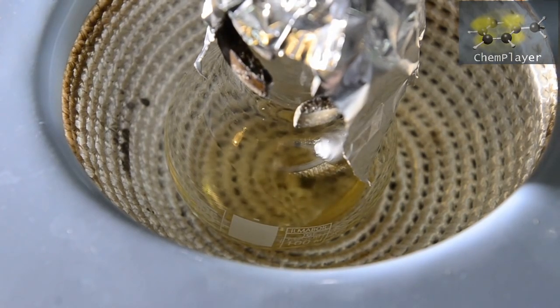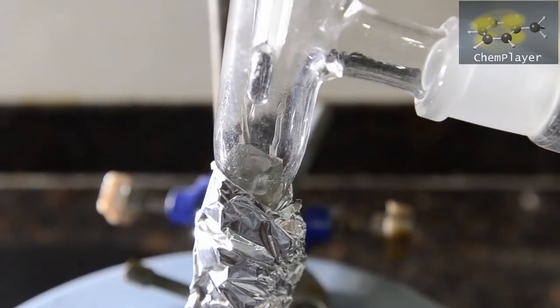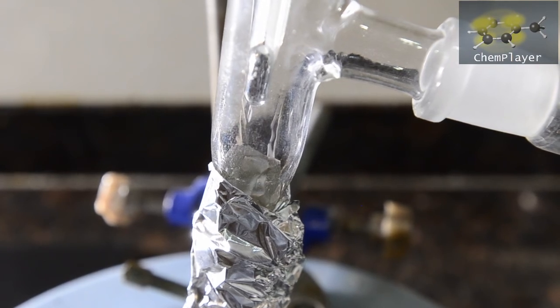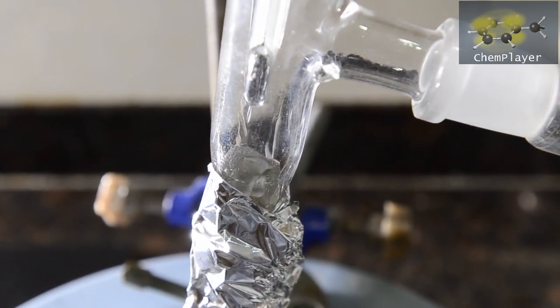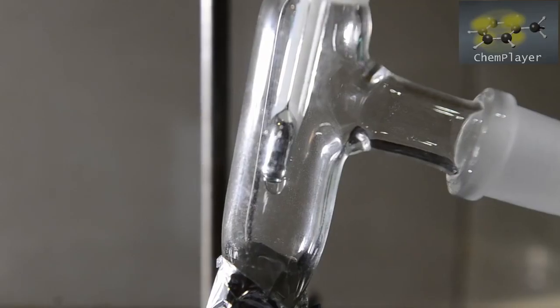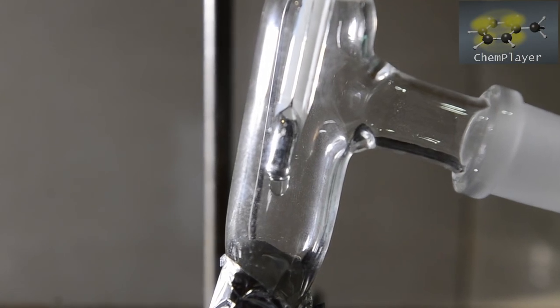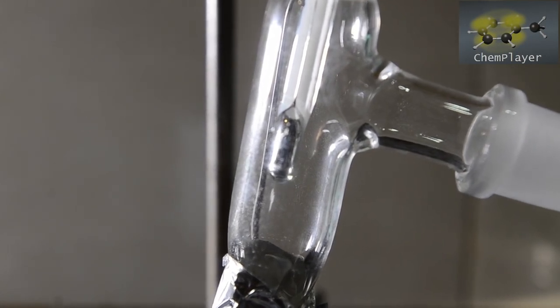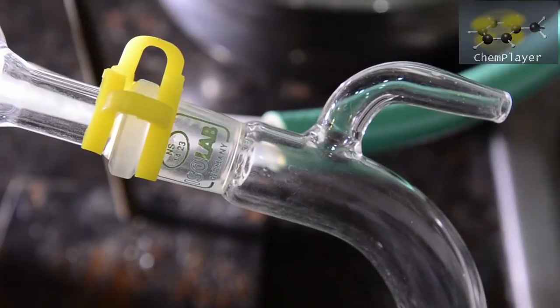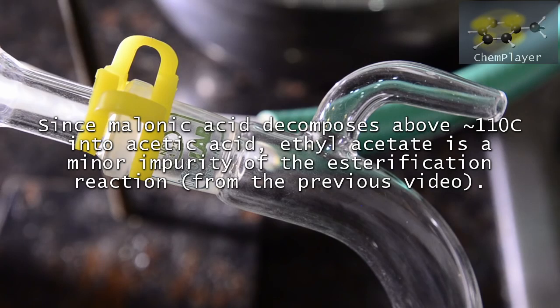We're heating and the liquid starts to crackle at first, a bit like a hot oil bath. We start to collect a small amount of liquid, only about 1 ml or so, at around 80 degrees C. This has a very characteristic aroma and is ethyl acetate, an impurity due to acetic acid being present in our previous esterification mixture, probably due to malonic acid decomposition.